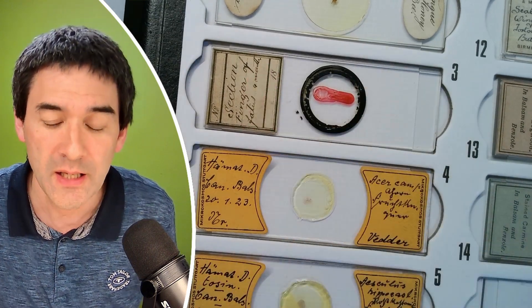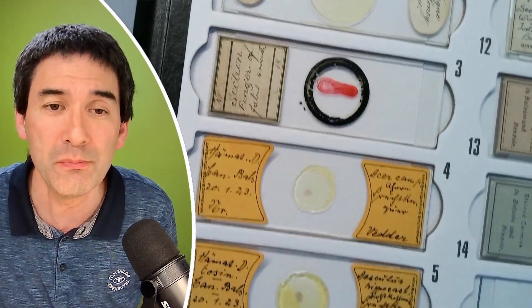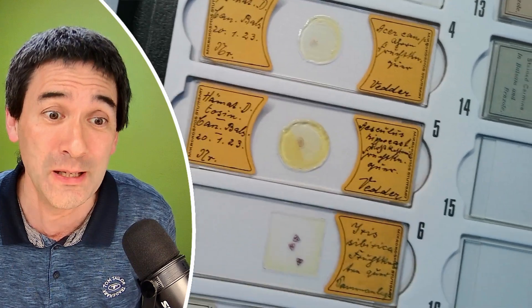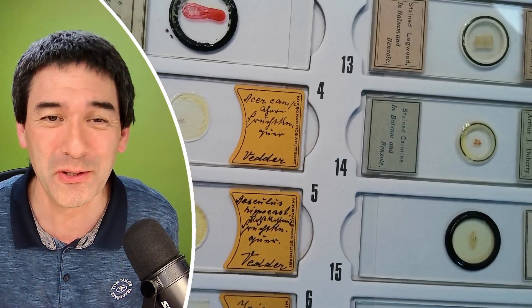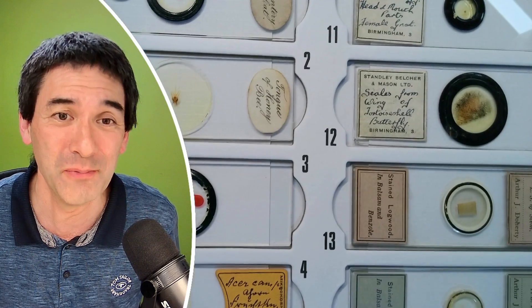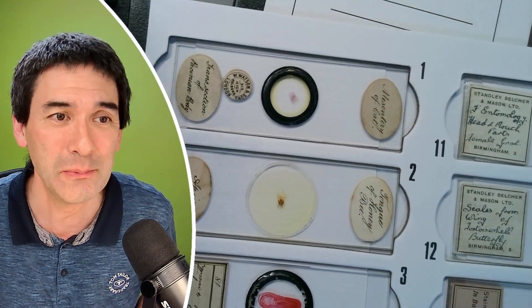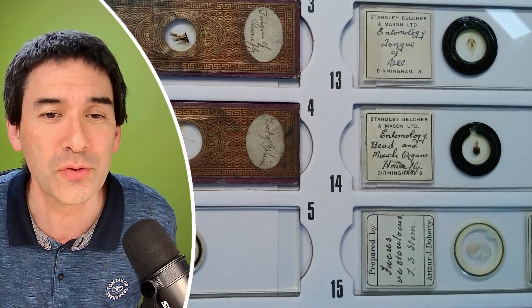So essentially, I'm saying this because if you are also manufacturing or making slides — either for hobby or commercially — please put a date on it. Because who knows how long the slides are going to be around. This actually shows a little bit of the high quality that some of these slides have. I decided, why not put one or the other slide under the microscope as well. And we've got some insects over here.